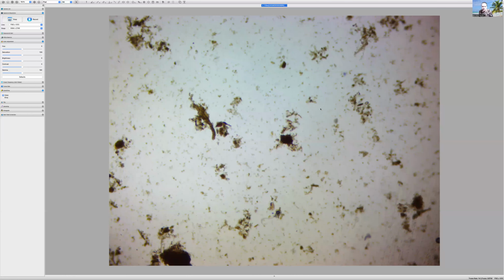Are we recording? Let me get my microscope camera to share. Right, here we are. Let me move this out of the way. This is my camera. This is the sample of the protozoan infusion that I got going. I think we're on day 6.